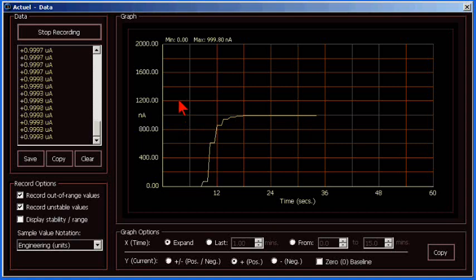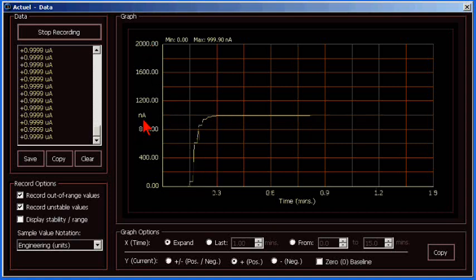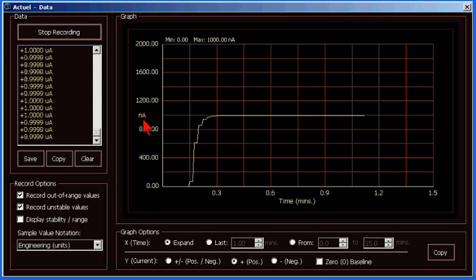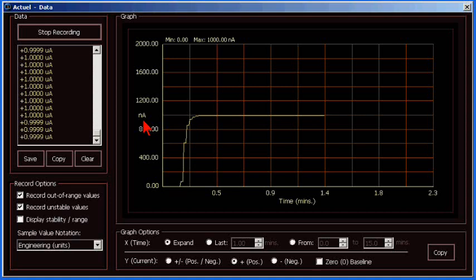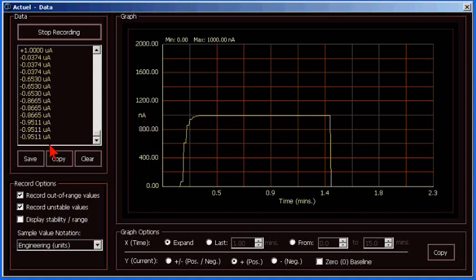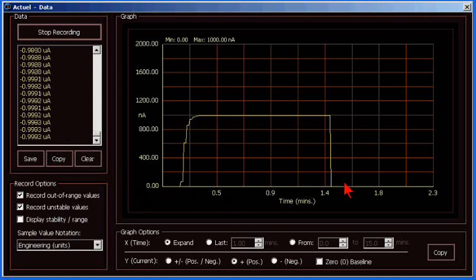But when I change the polarity to a negative one microamp, the display does not go below zero. Only positive values are displayed. Go positive again, and the display comes back up. So again, only positive values are displayed in the positive graph type.